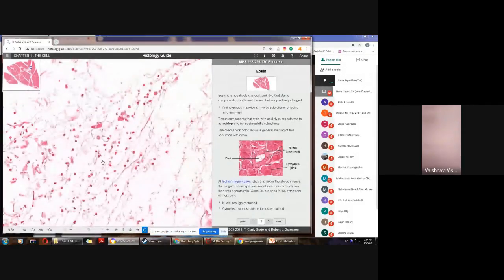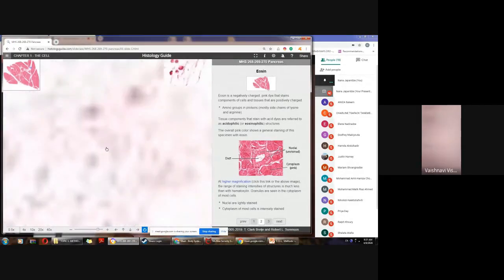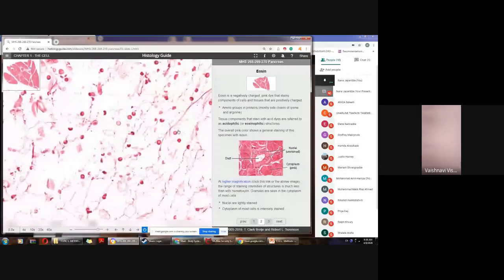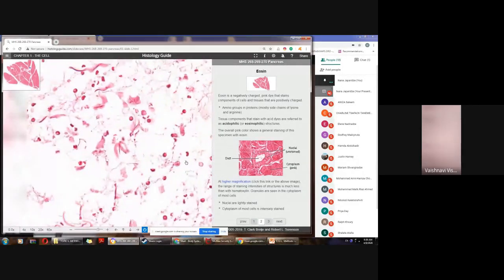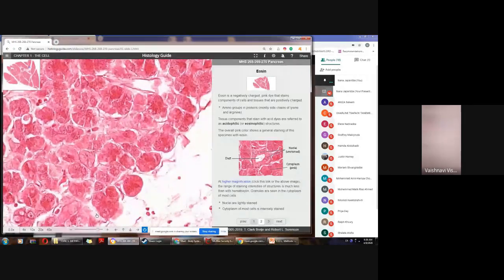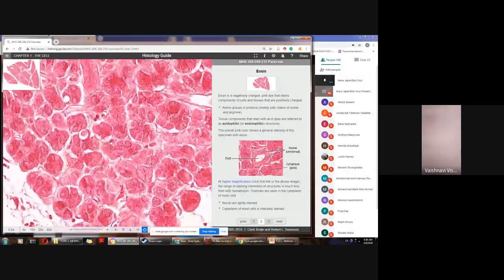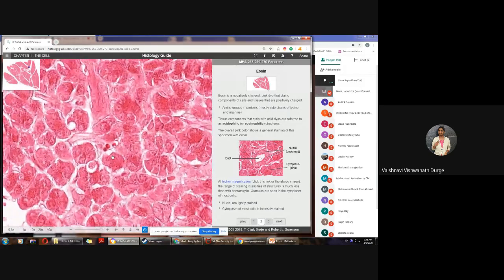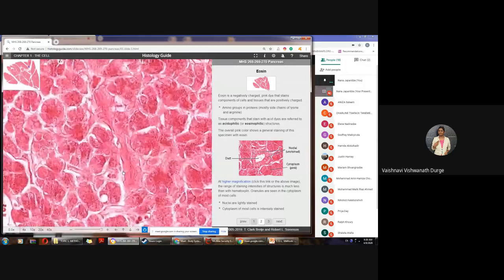Okay, so you see here adipose tissue. Also, the collagen fibers are identifiable, but the parenchymal part is constituted by the cells which accomplish the specific function of this organ. Look, you can see here capillary, the red blood cells in the capillary, in the lumen of the capillary.